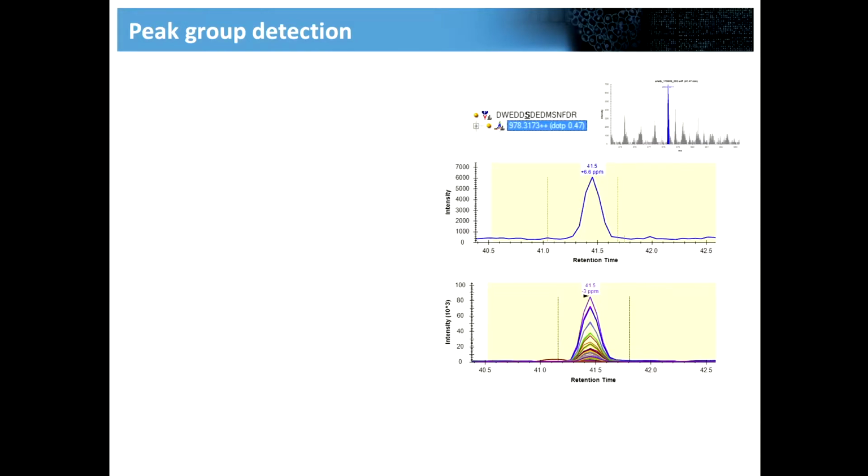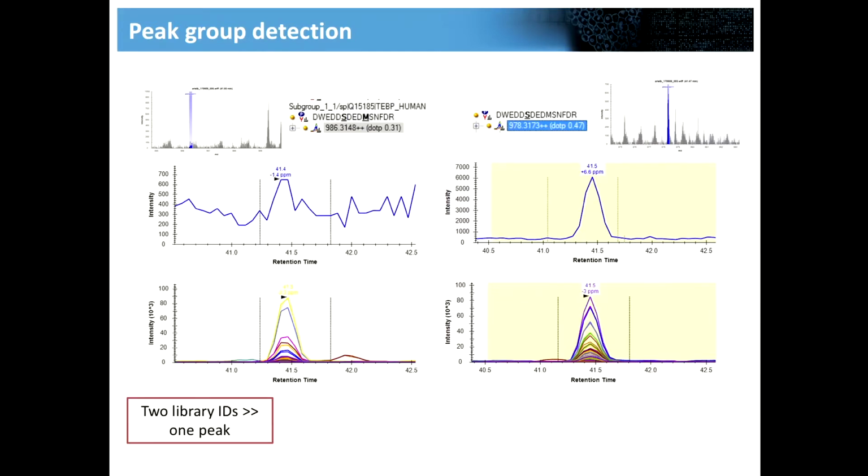Another thing that can happen very often, here, for example, I've extracted a peak for this sequence, modified here, and then I went to the data and extracted also the oxidized form of this peak, and without doing anything, it gave me the exact same peak, going to the same retention time. Actually, there was somewhere over here an oxidized form of this peptide.